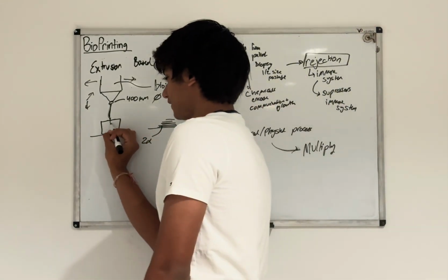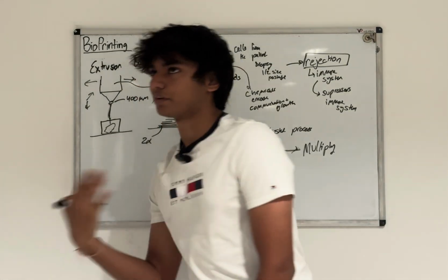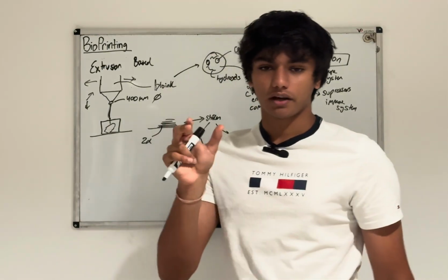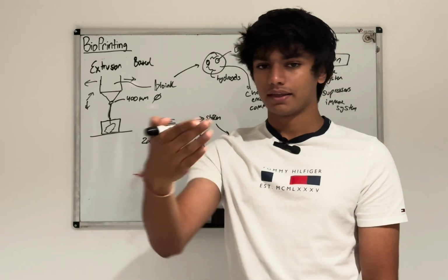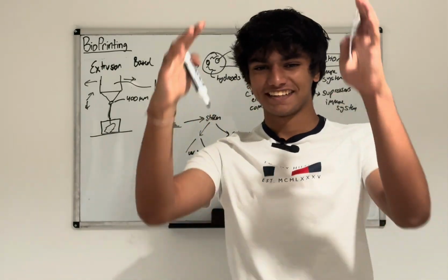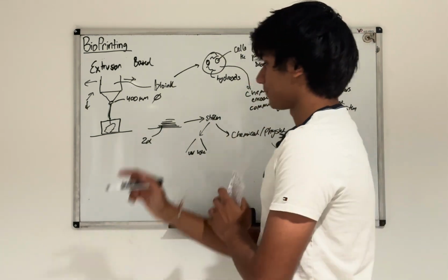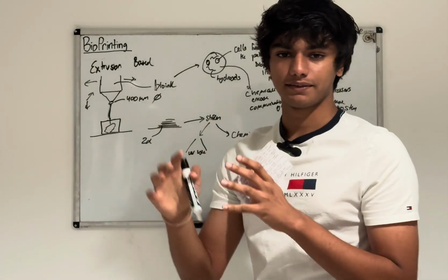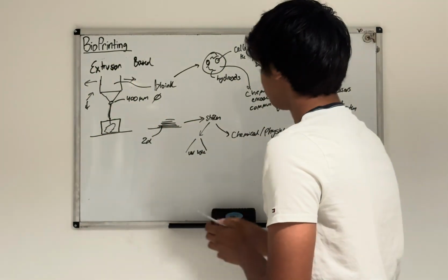So you can now make 3D structures with support. And again, this is very similar with 3D printers. If you've ever seen a 3D printer, you can see that a lot of 3D printers, when they're building complex structures, make structure supports in the actual design so they can support the object when it's being built. Same thing here, we just use a gel to make sure that the bioink can be supported in that structure, in that pattern.